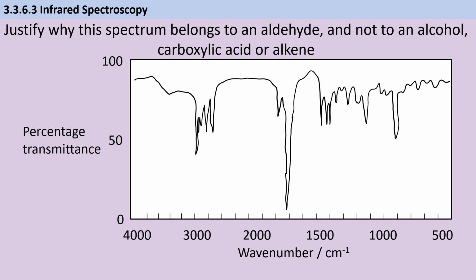And then rather than asking you to figure out the answer, they might tell you the answer and ask you to justify why that is the answer. So why does this spectrum belong to an aldehyde, not an alcohol, carboxylic acid, or alkene? We're going to be looking for the same things that we were looking for before, but in each instance we want to say this is the wave number we're looking at and it corresponds to this bond.